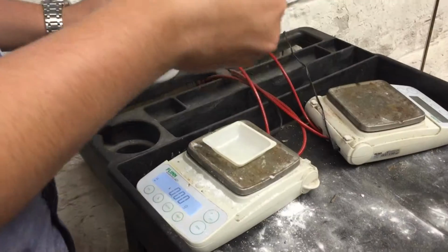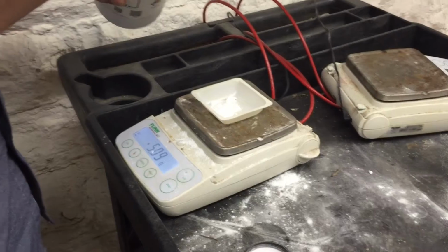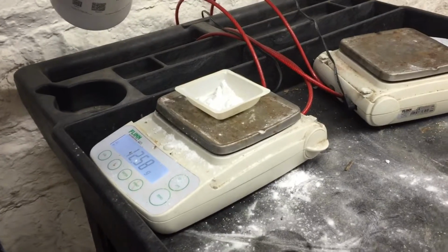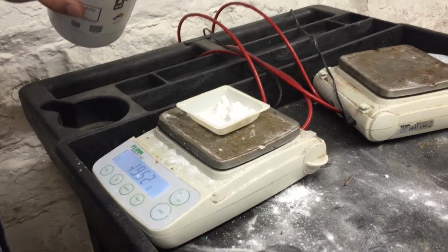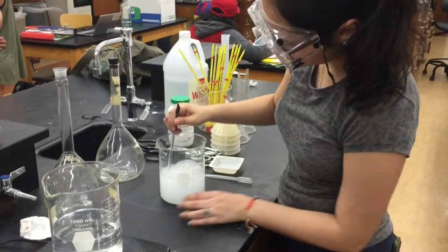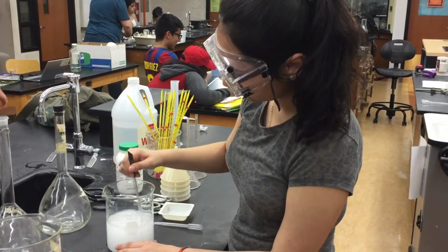First, we must measure 20 grams of starch in order to create a starch solution when mixed with water. Now we will add these 20 grams of starch into half a liter of water and stir it thoroughly.